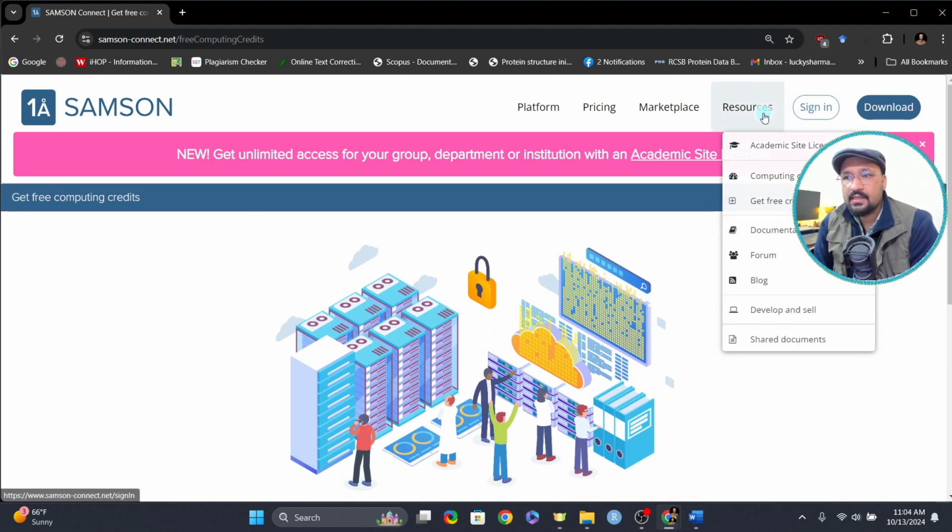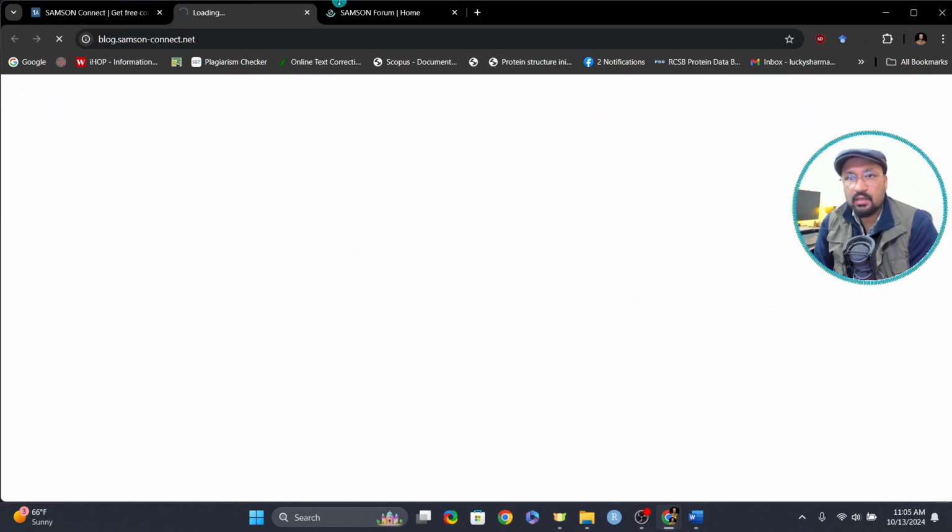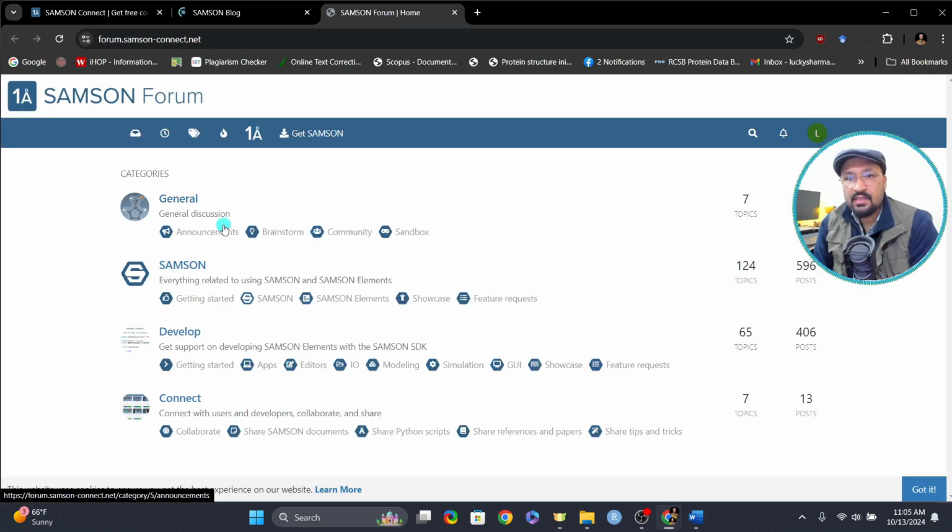Okay, what else? In resources, documentation is also available, and we have the AI to help us with the documentation, so we should be good. Discussion forum is also there. Blog is also there, and if you click right over here, it will direct you to the forum, and if you click on the blog, it will direct you to the blog one. And as you can see, general discussion is going on. There are so many posts, there are so many topics. We will get back to this one later on, right?